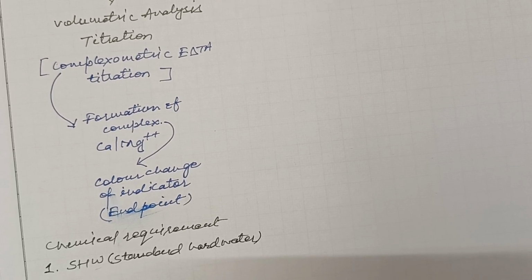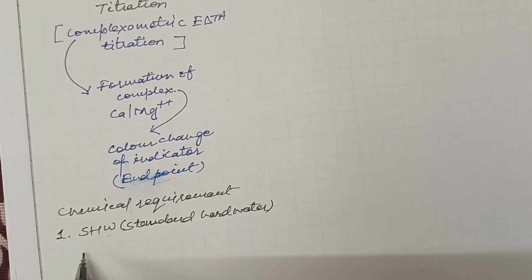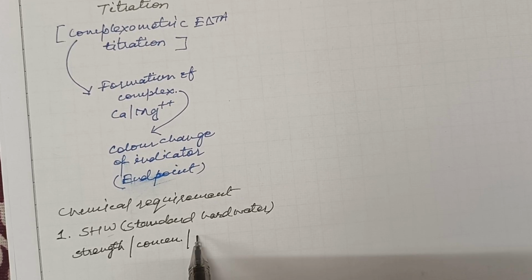Standard hard water is a water sample whose strength or concentration or hardness in this particular case is known to us.